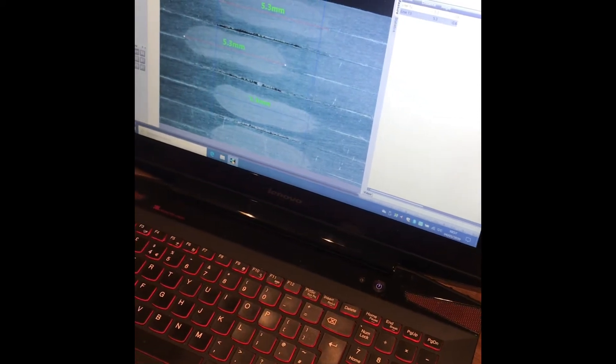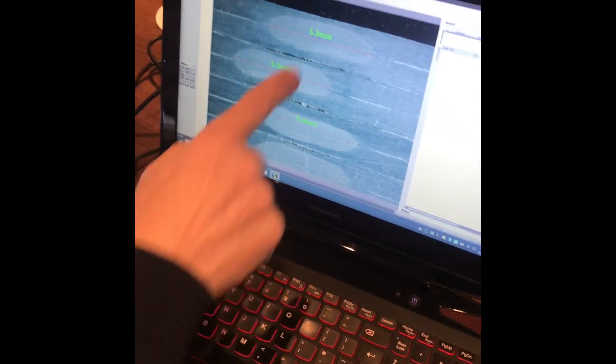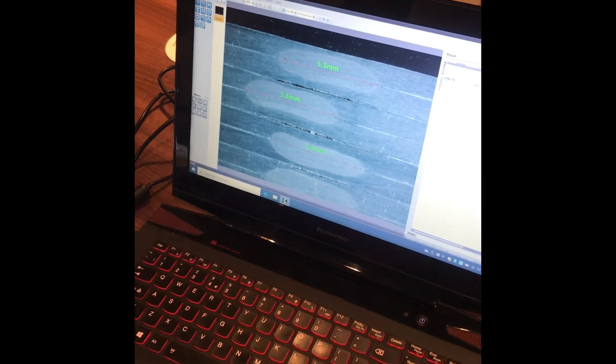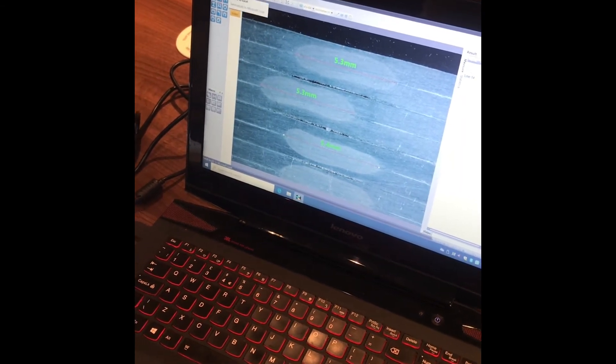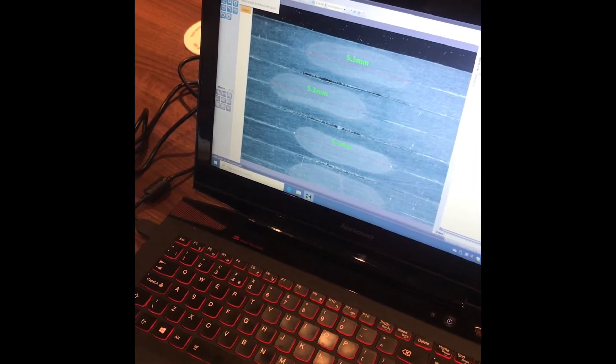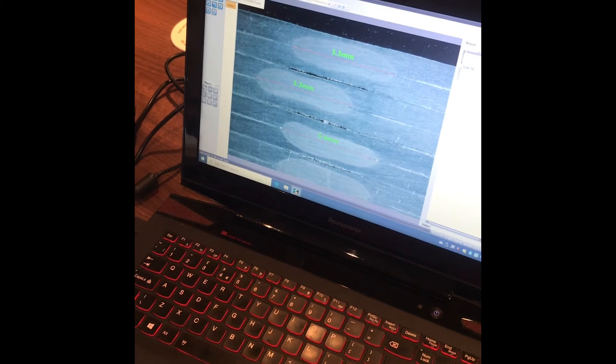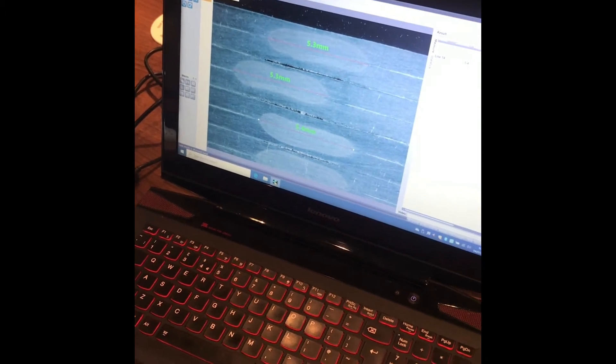There you go two and number three. So I have all my readings here. If I click on this little feature here it will send all the results through to Excel. So that makes easy reporting.